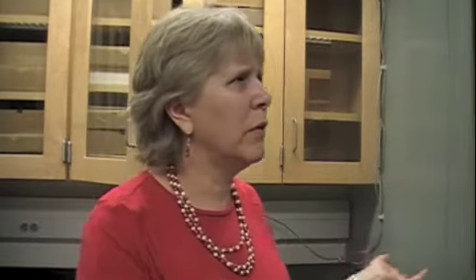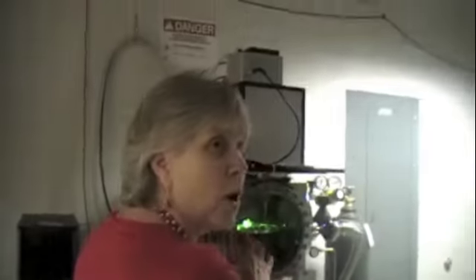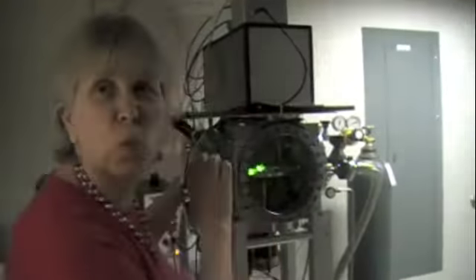There's just a bunch of rock dust in there, and then we press them in that telepress. When we get spectra from Mars, we match the spectra from Mars against our library of wiggly lines and essentially figure out what's the best match.